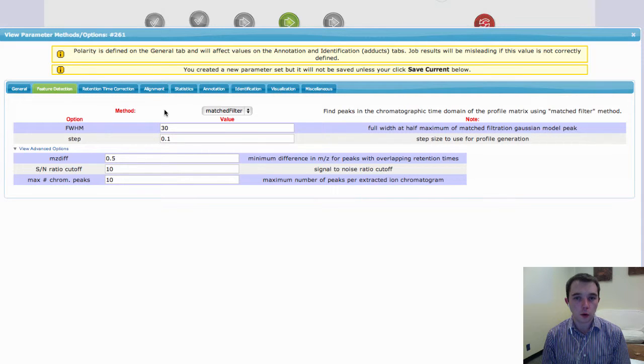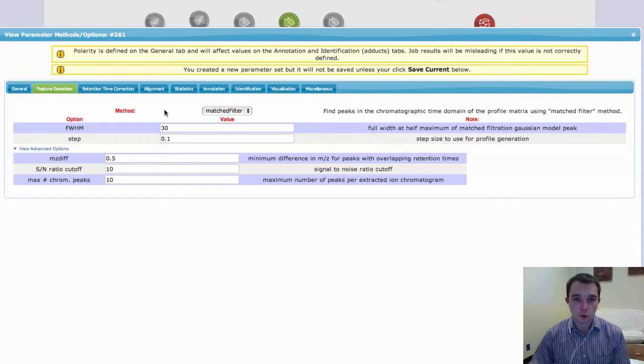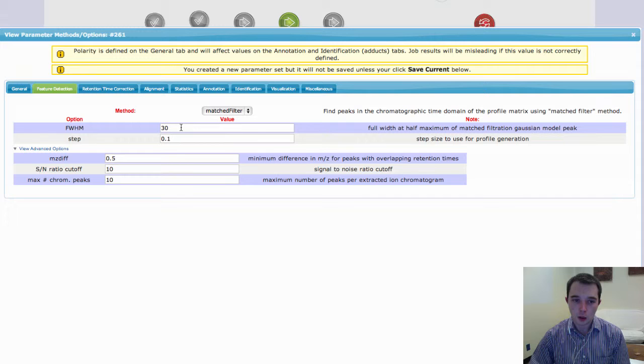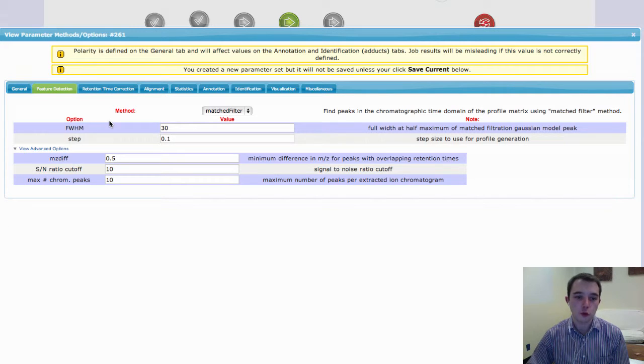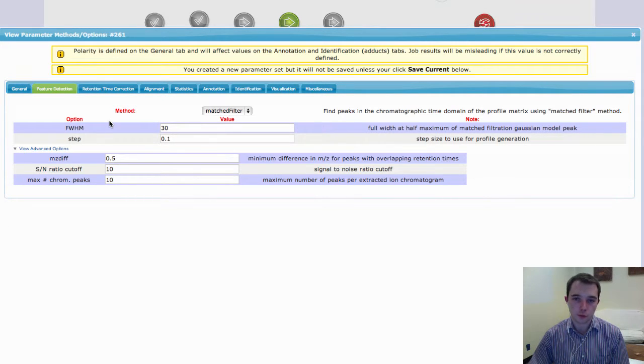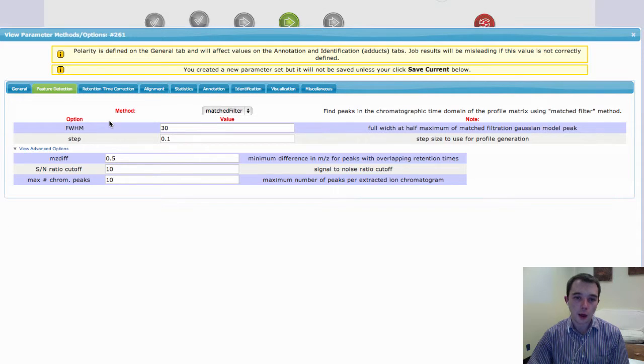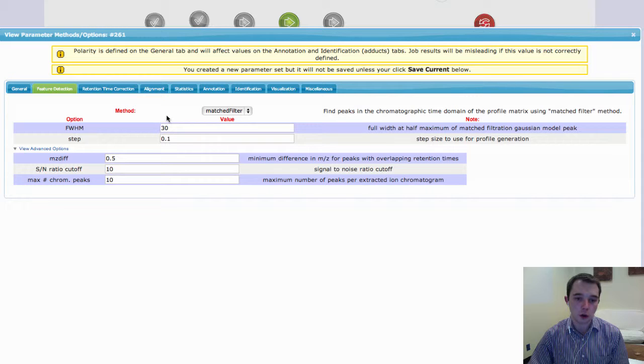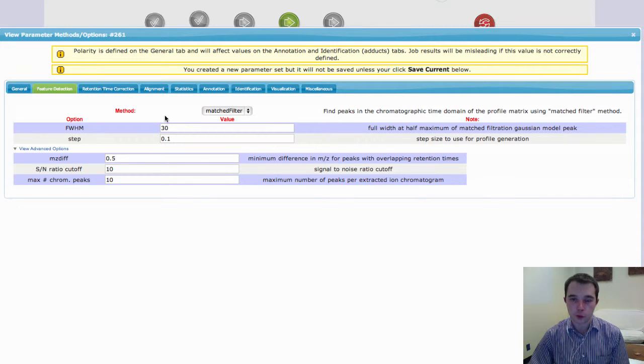Now, matchedFilter works on profile data, so if you have profile data which is high resolution, you need to be using matchedFilter. matchedFilter has two main parameter settings that you'll need to set, and the first one is the full width, half maximum. So this is how wide your peaks are in retention times on average.